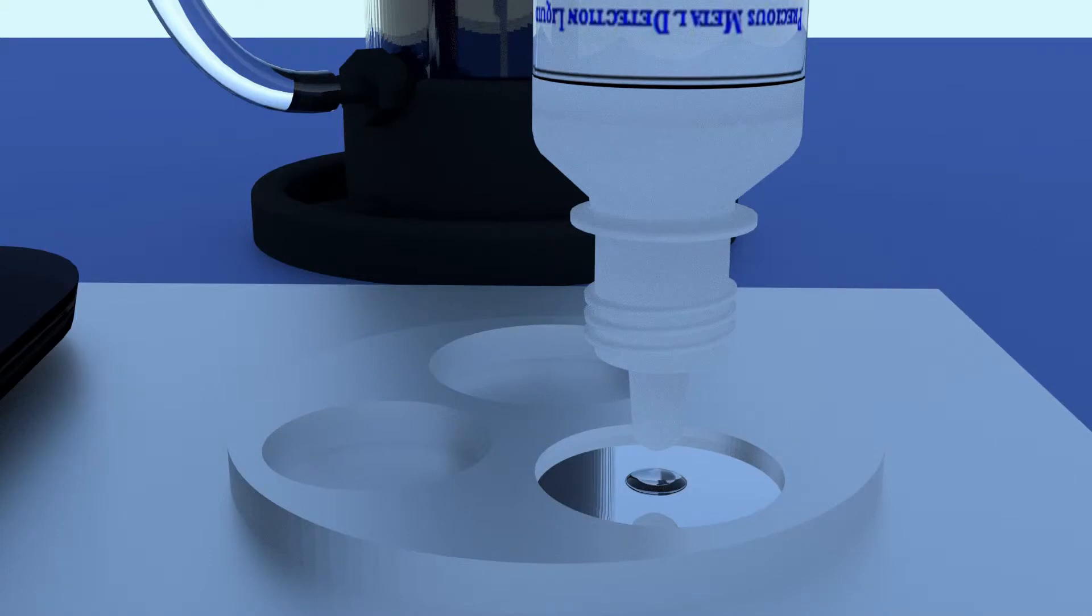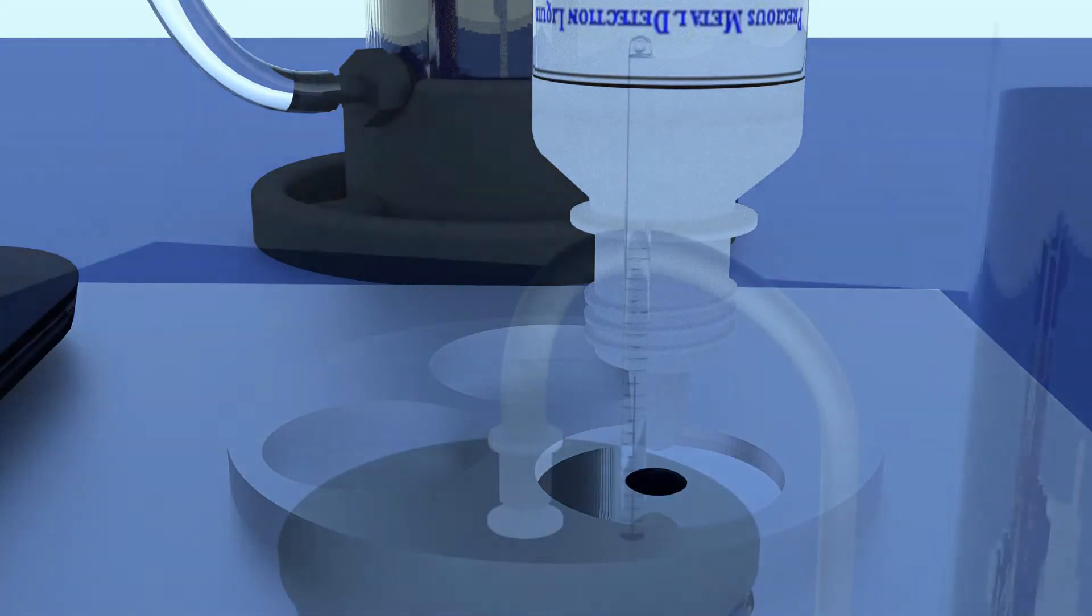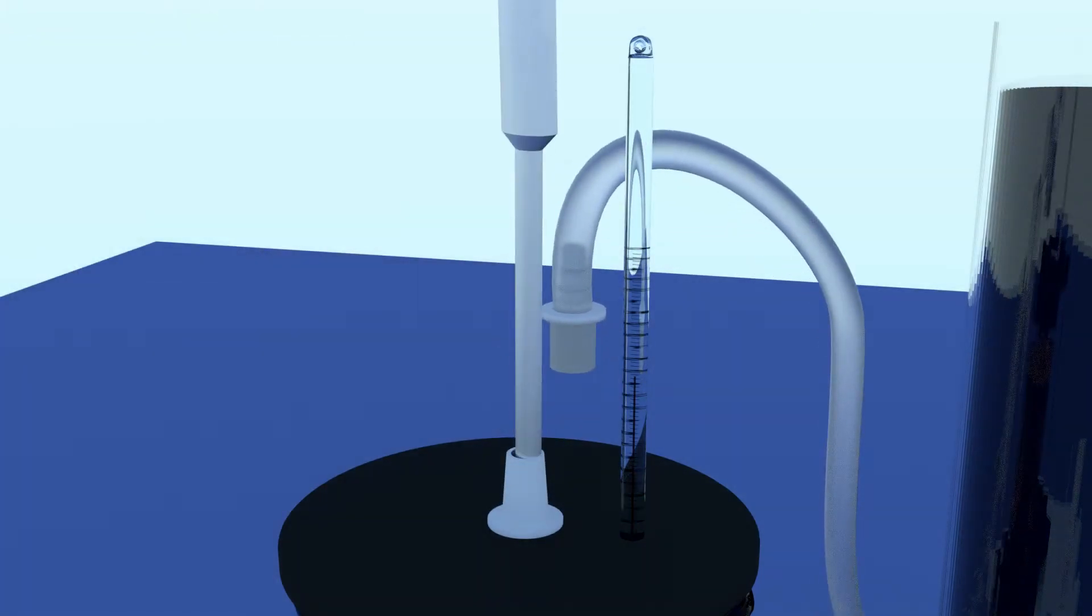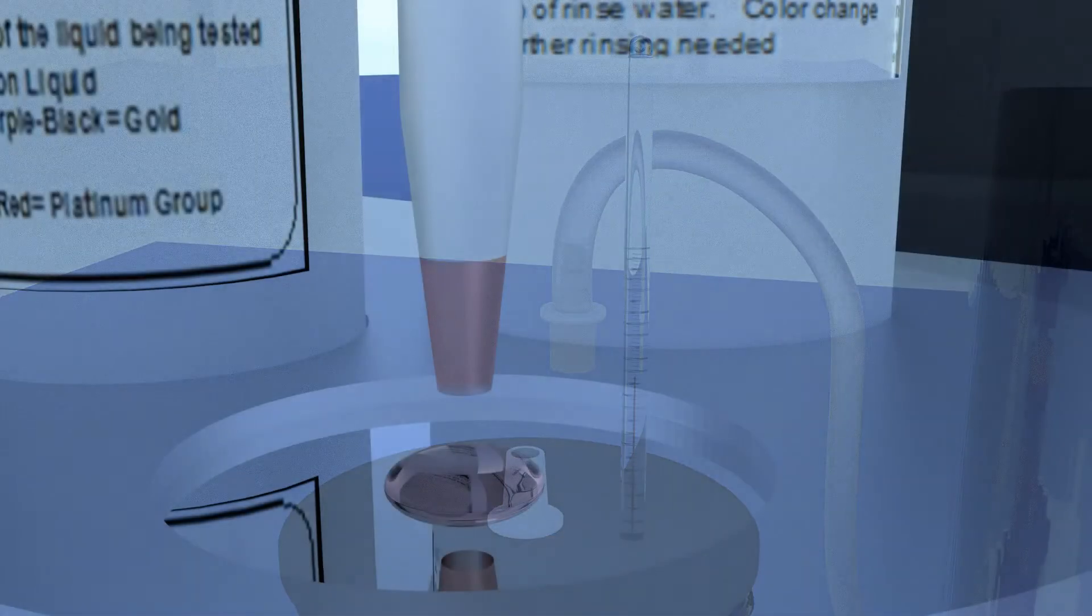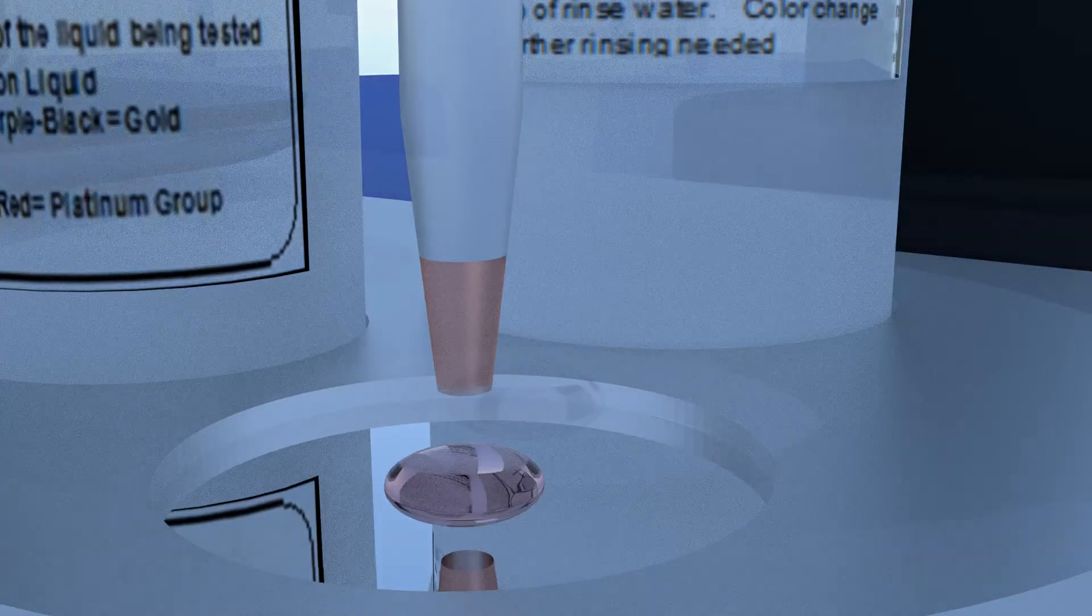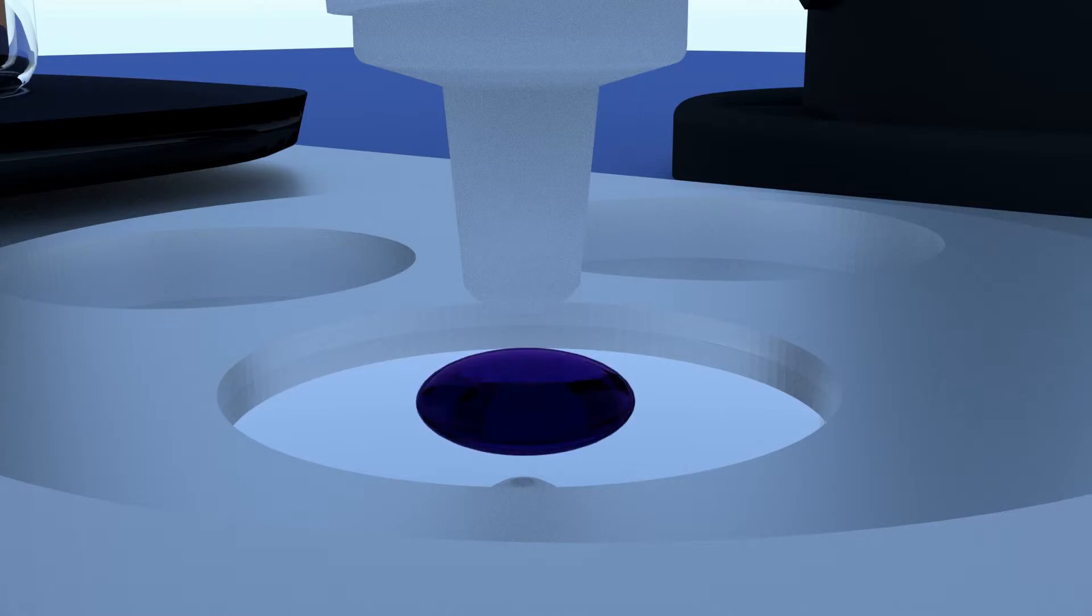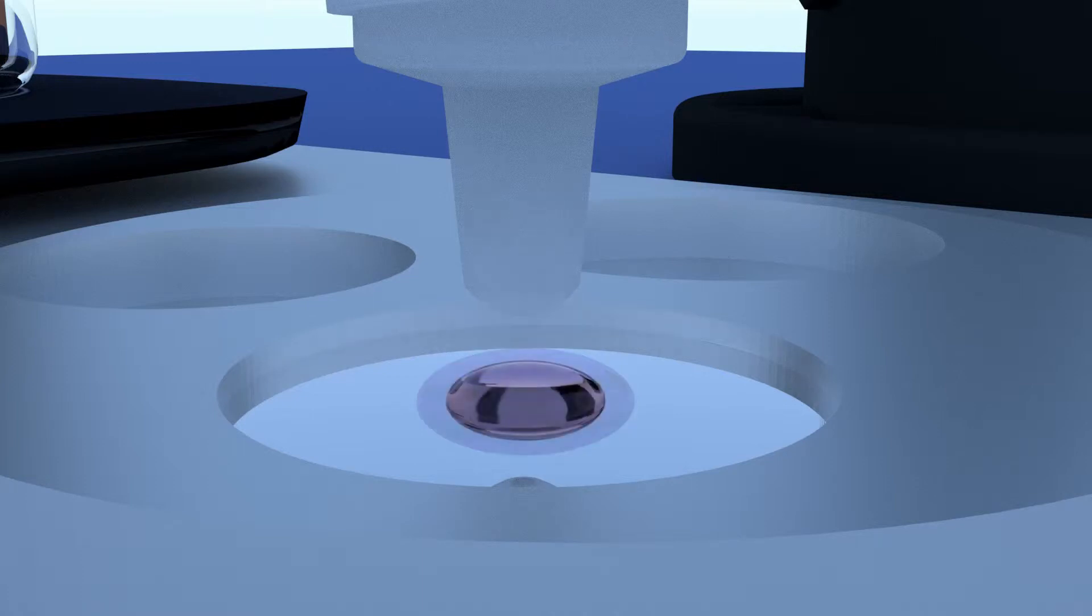This test is both highly effective as well as easy to run. Using the pipette, let's take a sample of the solution and test for the presence of dissolved gold. Place a drop or two on the spot plate. Now add a drop or two of precious metal test liquid. If any gold remains dissolved in the acid, the color will rapidly turn purple or black. When the test yields no color change, then no gold remains dissolved in solution and precipitation is complete.